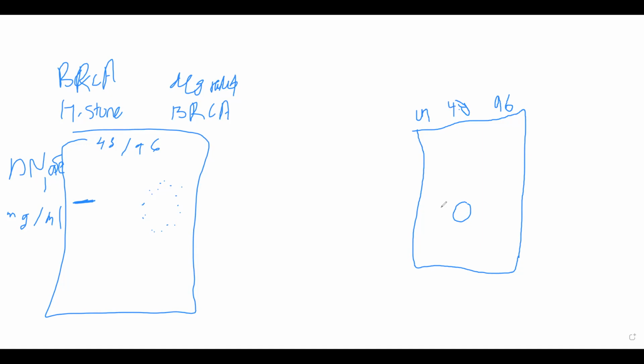we can see a light circle, which means that there is transcription, but not enough transcription to be shown. Comparing this to the 96-hour one, we will see that it is a darker circle, which shows that there are RNA levels, or there is transcription occurring, and it is increasing. Just to reiterate what I said, the test shows the presence of the specific RNA molecule. As time passes, transcription is increasing, which means that the mRNA is increasing, and that is shown in dark color at 96 hours.